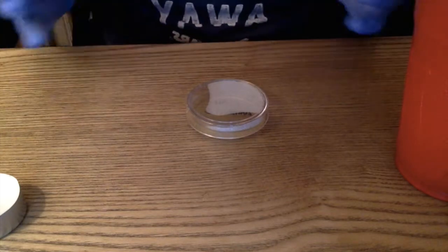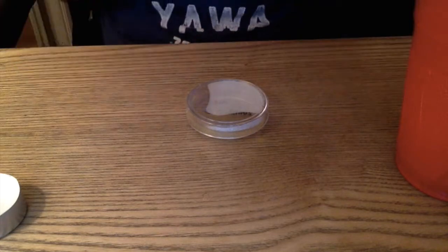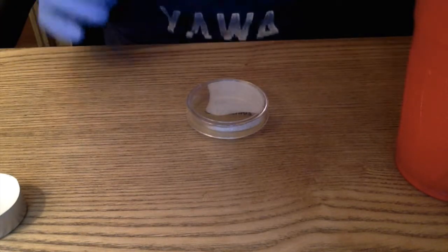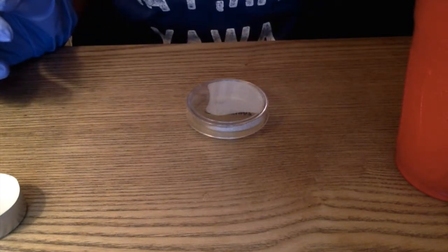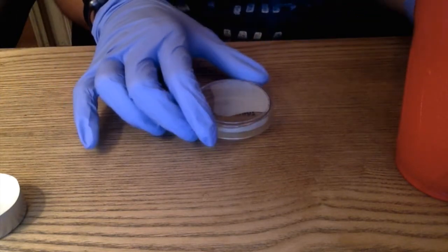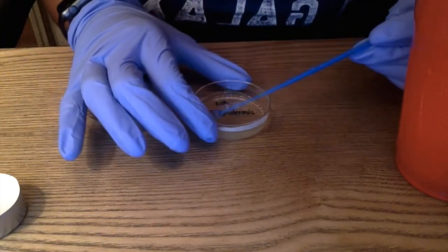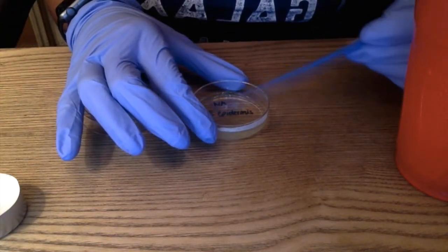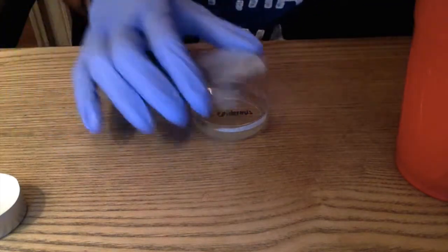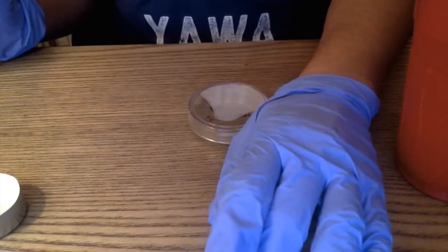coli, which I'll pretty much be doing the same steps I just did for the epidermis, and then I will go ahead and leave the agar plates to incubate for another 48 hours before being able to see the individual isolated colonies. So, for another 48 hours.